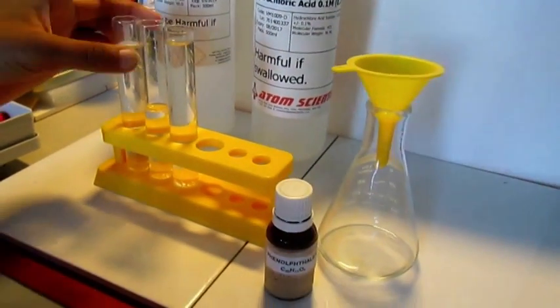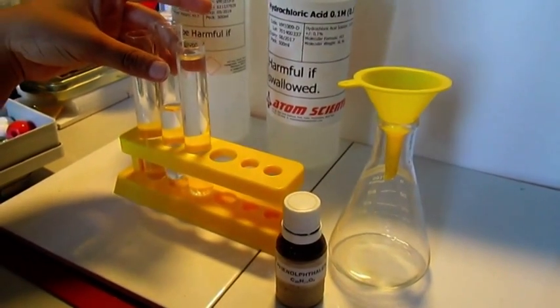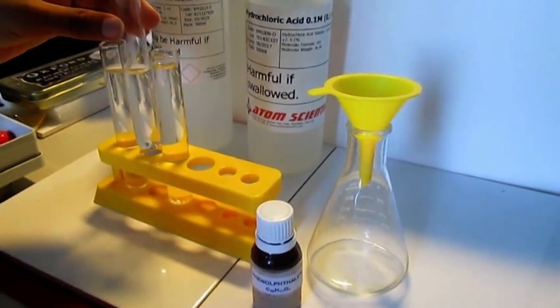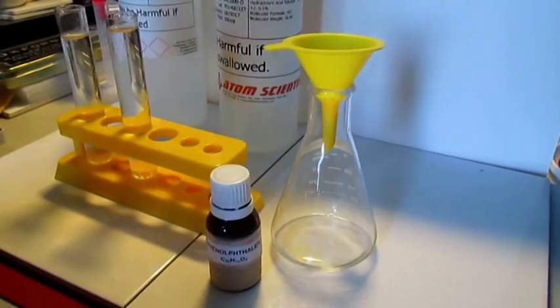You first pour the sodium hydroxide into a conical flask. You can see that it is a clear, colorless solution.